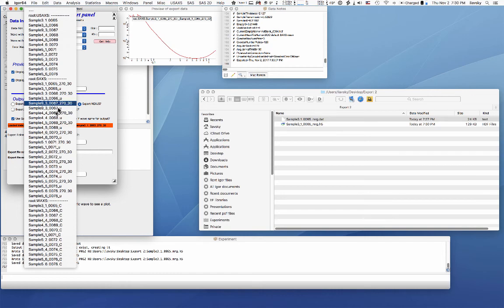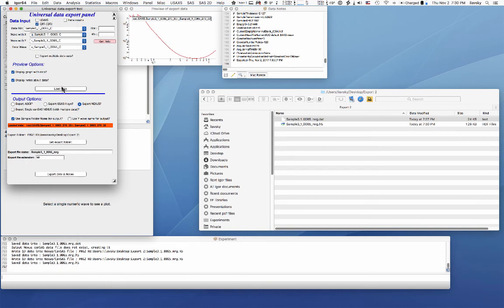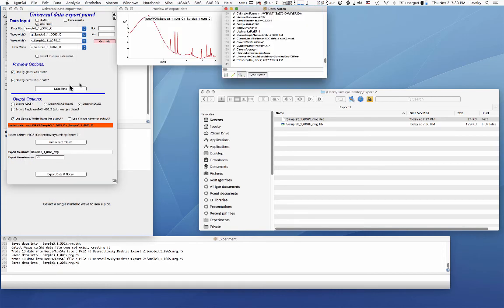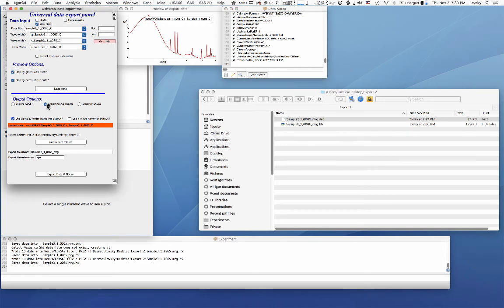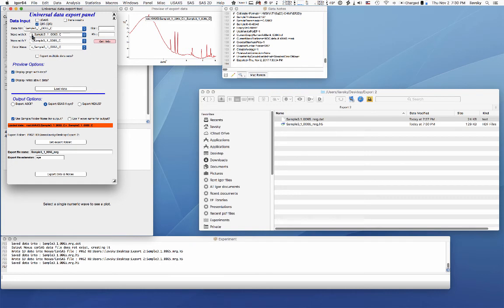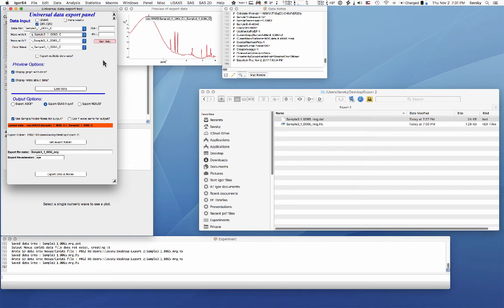You can load them. You can export GSAS-2 XYE data. These data will export two data. So in NIKA, you can use these data even as a powder diffraction. They have a Q as the X axis. In NIKA, you can generate D or two theta data. It doesn't matter. It doesn't care. And you can do either one of those three. But for GSAS-2 or other software packages in powder diffraction, you actually need the two theta data. So this tool, if you select that and then you run this, it will generate you XYE dataset.